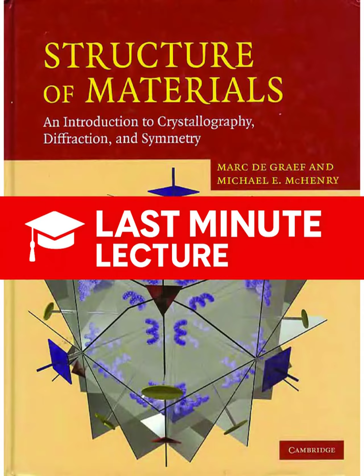Now, when we discuss X-rays, physics always brings up this concept of dual nature. Yes, wave-particle duality. We have to consider them both as waves and as particles. So sometimes it's a photon, sometimes it's a wave. Exactly. Sometimes the energy properties, the photon aspect, are more relevant, and sometimes, like for diffraction geometry, the wave aspect is paramount. For our purposes today, the wave is key. So what is that wave?